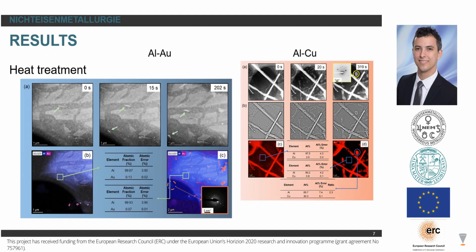For the aluminum copper, we see clearly that something was occurring. After the melting, we have maximum solubility of copper in the matrix, and after the heat treatment as well, we are following the phase diagram as expected. And we found a really good precipitate, and analyzing it, we have the same or a similar ratio of aluminum copper to the theta phase, which would be 2, so 2 aluminum for 1 copper.